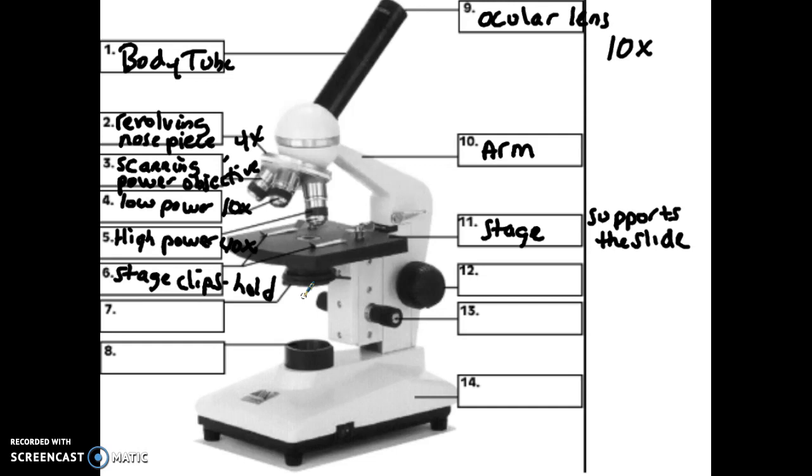So the two knobs over here, number 12 and 13, 12 is what's known as the coarse adjustment. Coarse adjustment, if you think of coarse in that spelling, coarse is like sandpaper, rough. It has a larger degree of movement when you move this coarse adjustment knob. And what that does is it's going to focus.